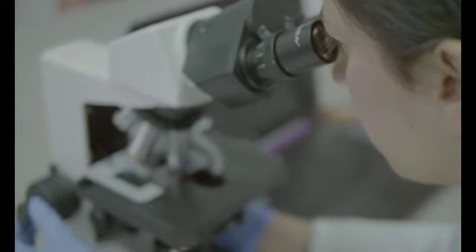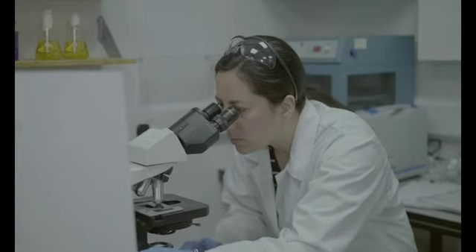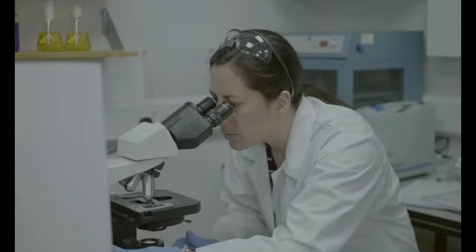I perform a wide range of testing here at the Novaris lab. I would mainly focus on efficacy testing, research, and quality tests.